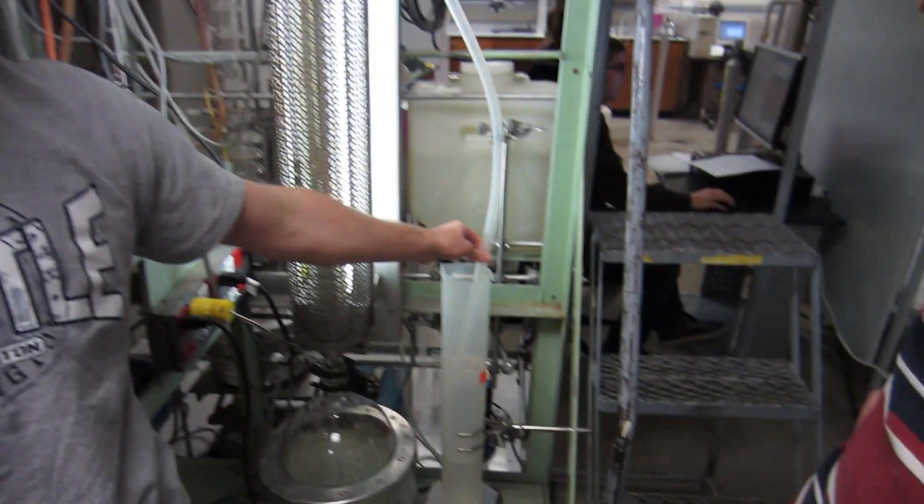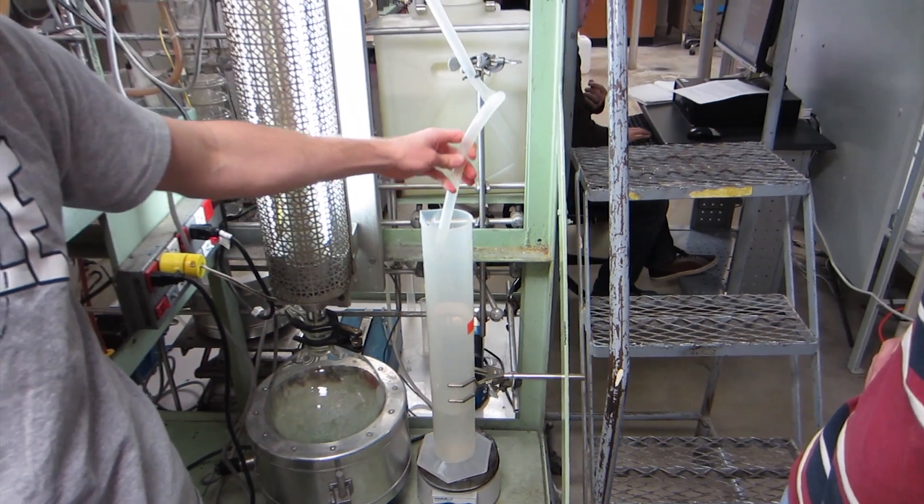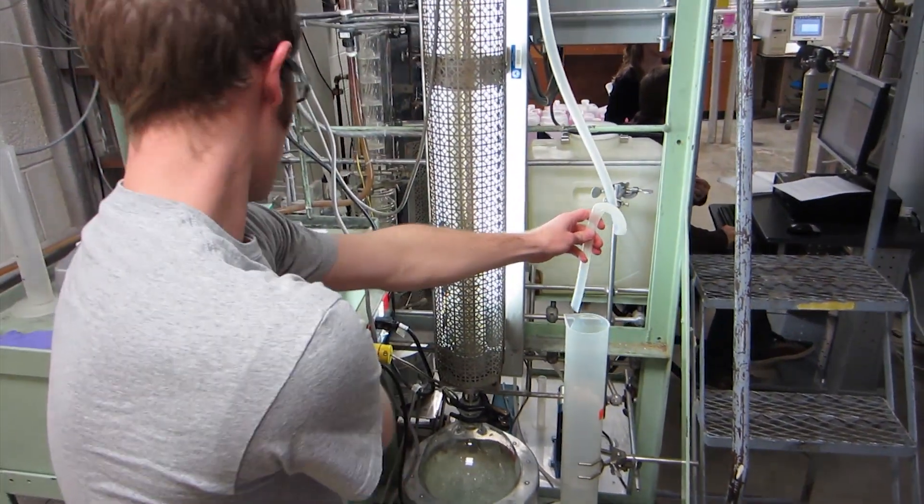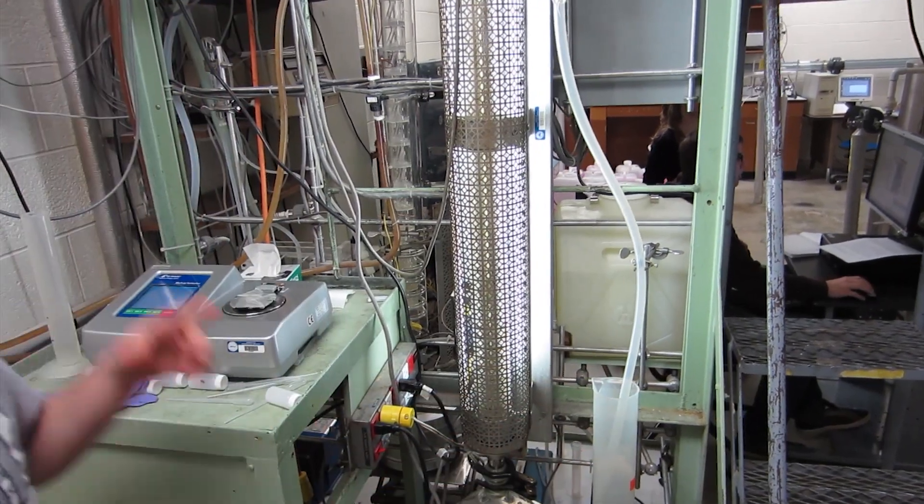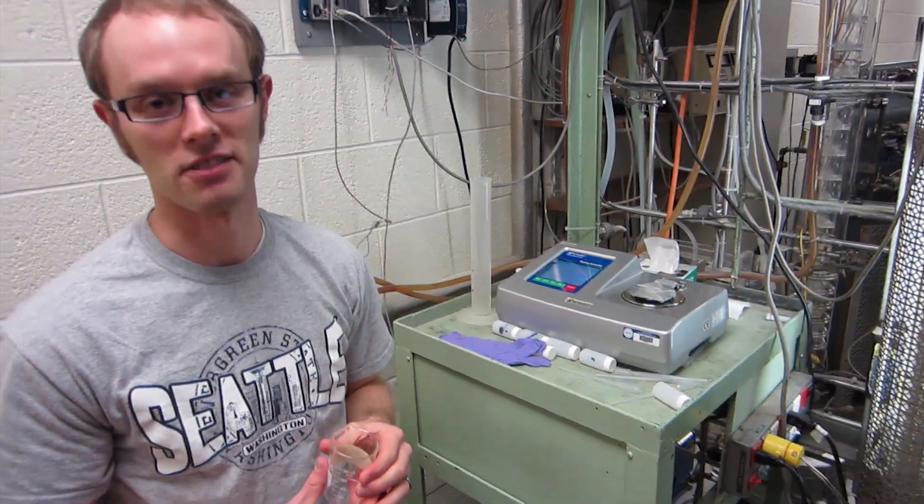The distillate is found right here. It comes out of this tube. You can take that and put a little bit into this beaker, and that's what you use to put in the refractometer.